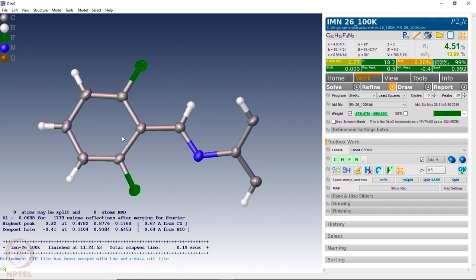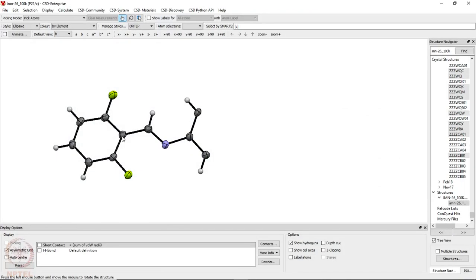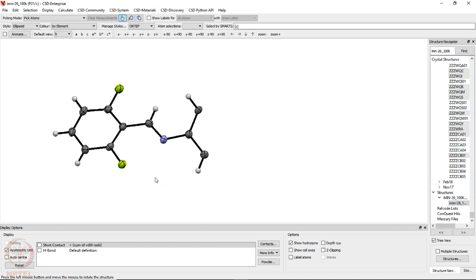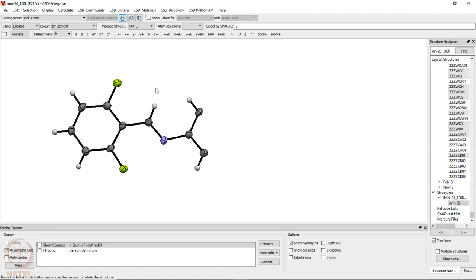Once we have solved and refined the structure well, we have also seen how to validate the structure solution and refinement. Any mistakes or problems with the data are evident from the checkCIF report, which one must then address. To visualize structures, generate packing diagrams, and obtain geometrical parameters, one can use Mercury software, which is available free of cost from CCDC at a basic version level. The full license version is available with the Cambridge Structural Database subscription, which is a paid version.